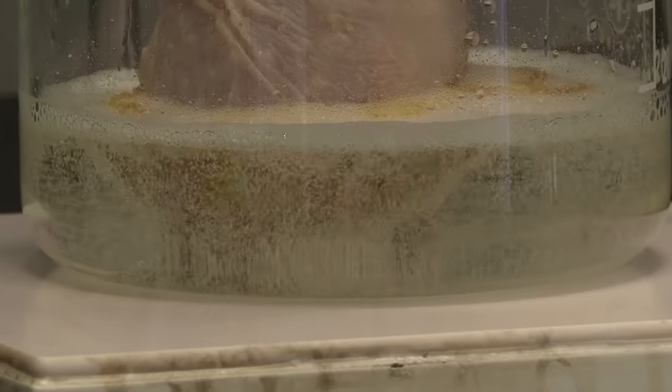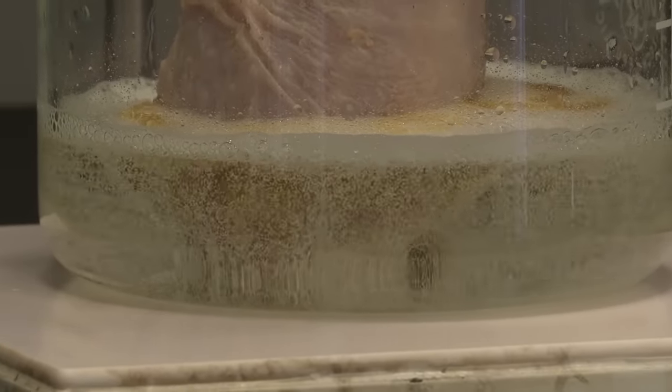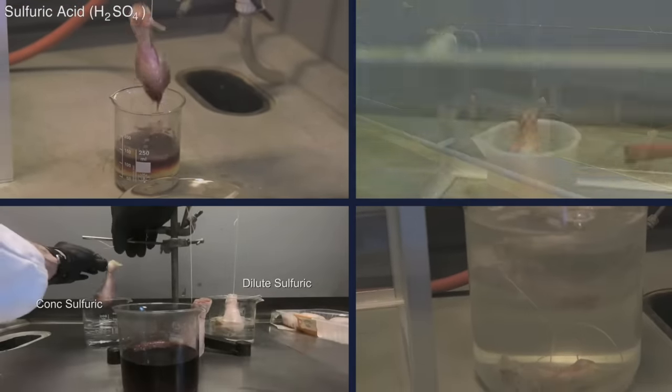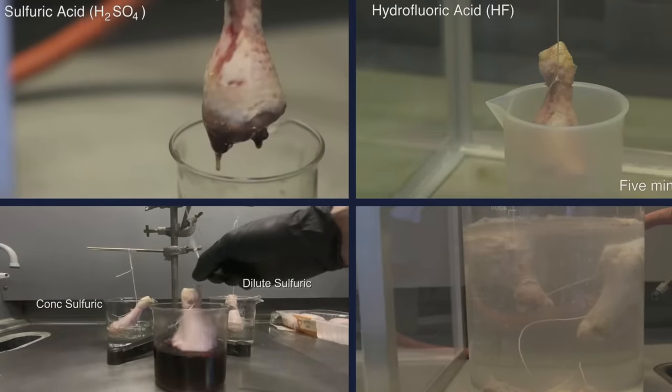The amazing thing with the chicken leg in Piranha Solution is that the reaction went very much faster than in all the other acids we've tried. Previously, Brady had to video for a whole 24 hours to get much effect. But this time, the effect was much more rapid.